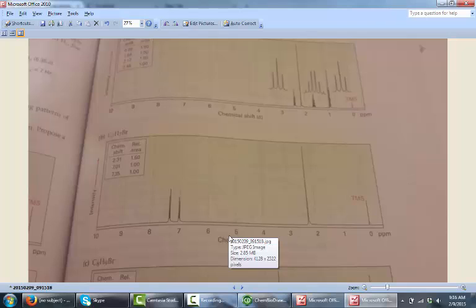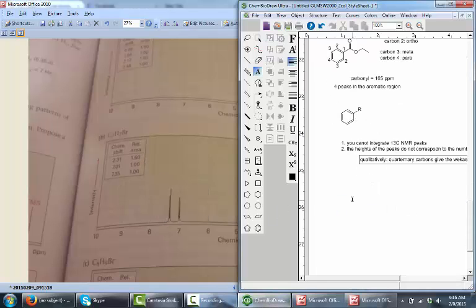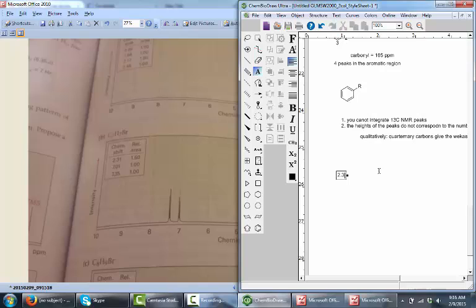When I look at this compound with 7 protons, I can see that the areas for my 3 different signals, so 3 types of protons, are in the ratio of 1.5 to 1 to 1. So right away I'm going to make the 2.31 ppm signal 3H, the 7.01 ppm signal 2H, and the 7.35 ppm signal also 2H. That's 7 protons. Instead of 1.5 to 1 to 1, I just multiply those areas all by 2 to get 3 to 2 to 2.